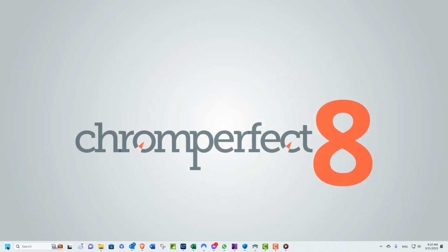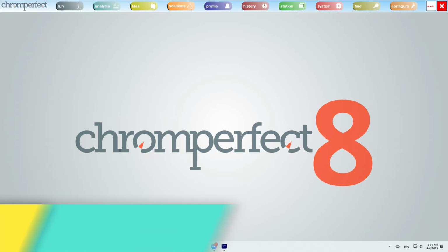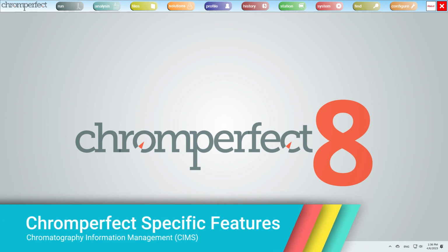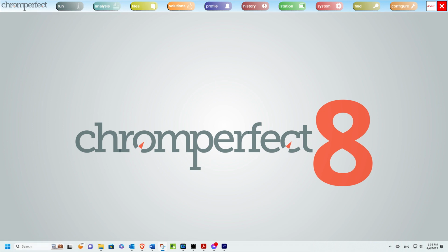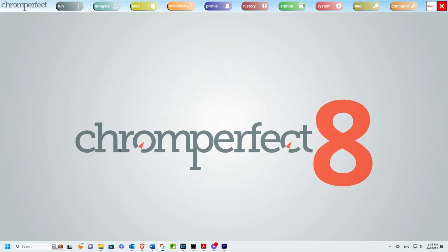This video is part of a wider chapter looking at specific Chromperfect features. The CIMS Program. The Chromatography Information Management System utility provides a way to search selected directories for Chromperfect files and create lists of files that match specified criteria. Output may be directed to the printer, a PDF file, an ASCII text file, or a sequence file. Within its purview, CIMS can search as efficiently as some LIMS. CIMS is not intended to replace a LIMS.